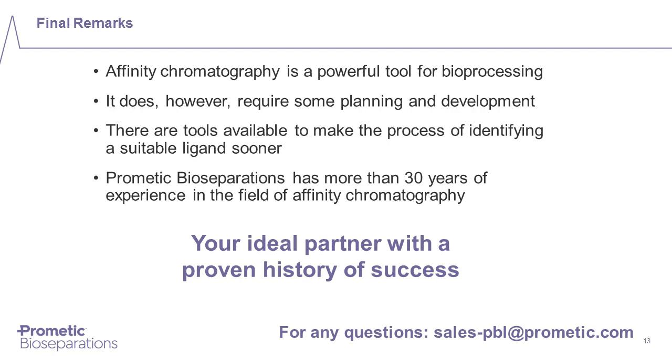But in our case, we will most likely start with agarose and polymethacrylate, which we know work very well. There are other possibilities that can work, but you have to test, essentially, unless you have a specific constraint that rules out one base matrix or the other.